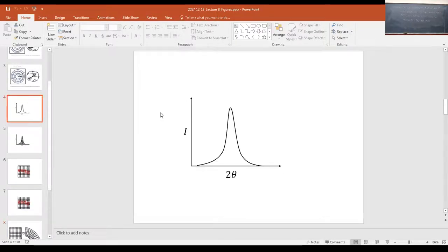And then when we're finished, hopefully we have a distribution of intensity versus 2 theta. And what we'll have is diffraction peaks that we can now start to analyze to look at the response of different subsets of crystals. One way to think about these distributions of intensity is that they are a sum of contributions from all of the crystal volumes which lie along the fiber.